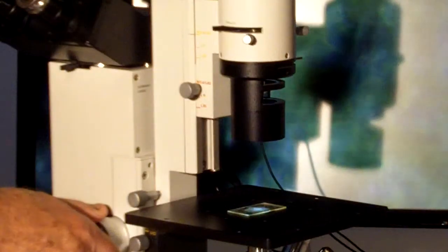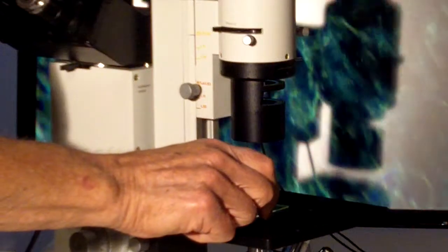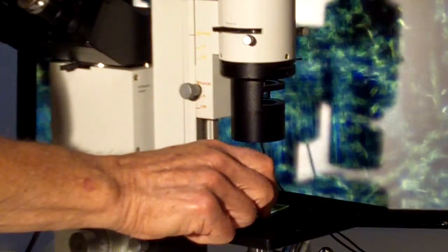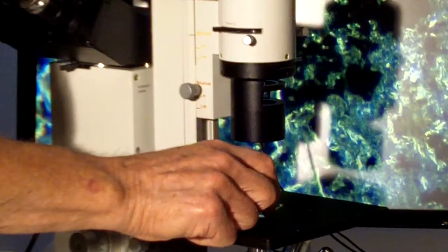And here we have a very nice low power dark field of this mineral sample.